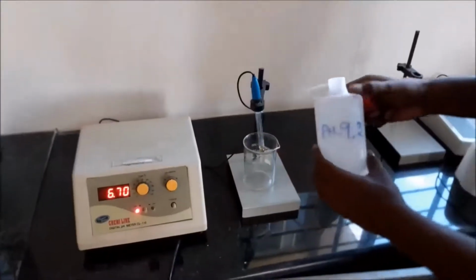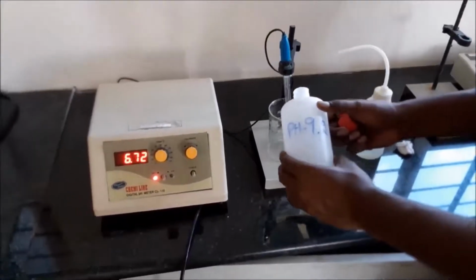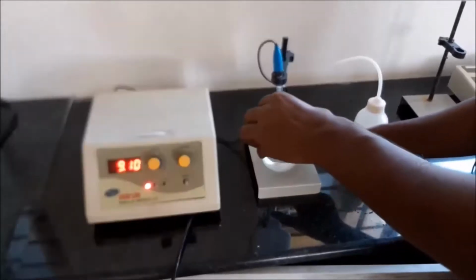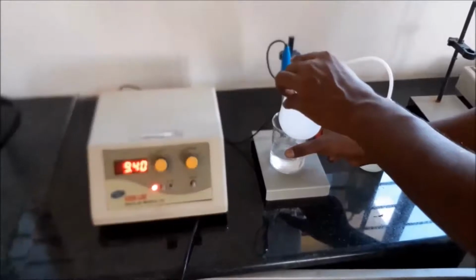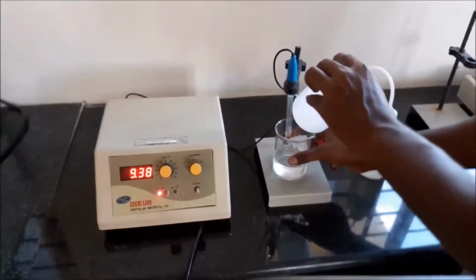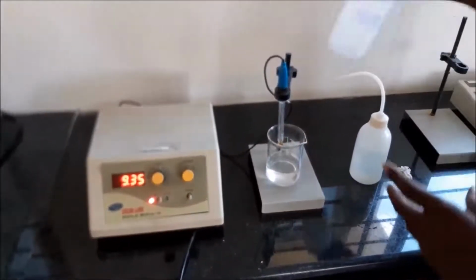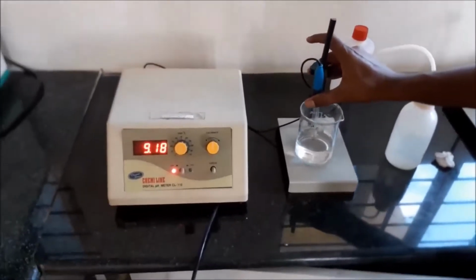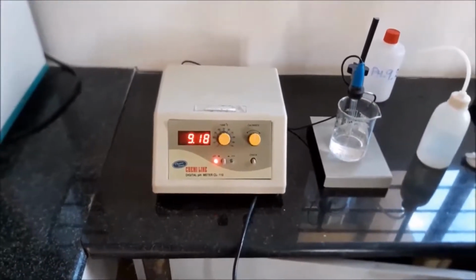The next set of buffer solution for the calibration of pH value equal to 9.2 is taken in the beaker. And then the electrode is immersed into the buffer solution to make sure the value is almost equal to 9.2.